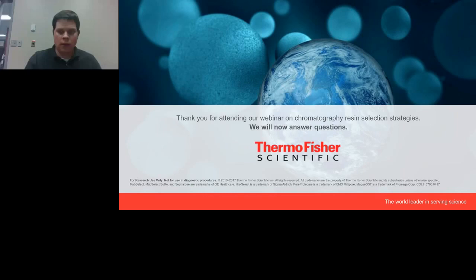Yeah, so we've used magnetic agarose for IP and co-IP experiments. The nickel NTA and glutathione magnetic agarose beads also work for pull down experiments or bait prey evaluations of looking at binding partners. Since the beads have a lot higher binding capacity than other magnetic agarose or other magnetic beads, you would want to use lower volumes. Typically, we're using like 10 to 20 microliters of bead slurry. But again, since the beads have a lot higher binding capacity, they're more geared for high throughput, low scale purification.